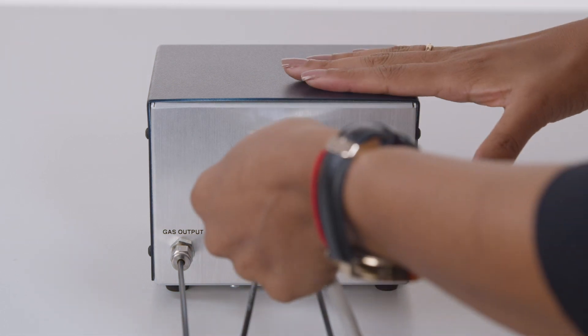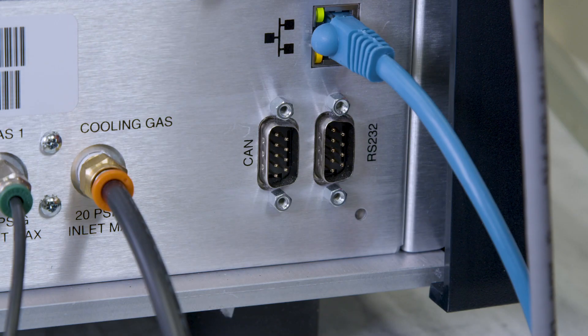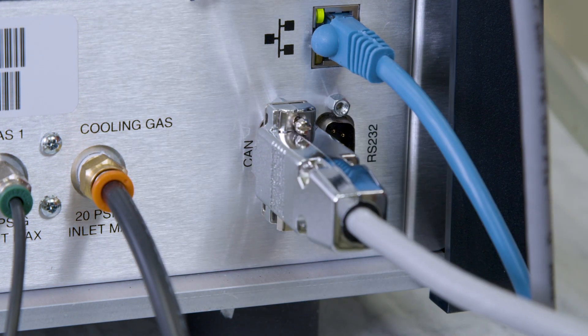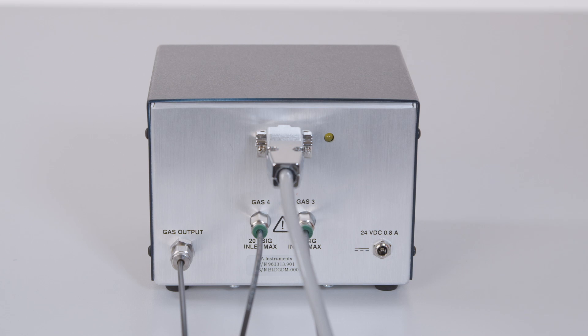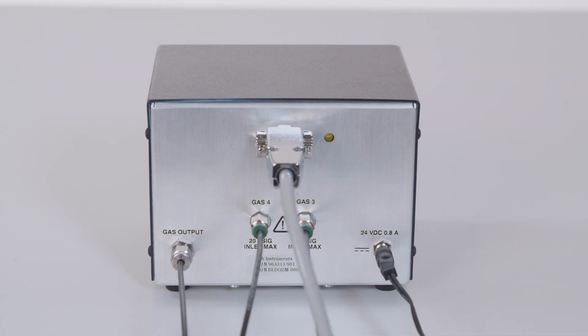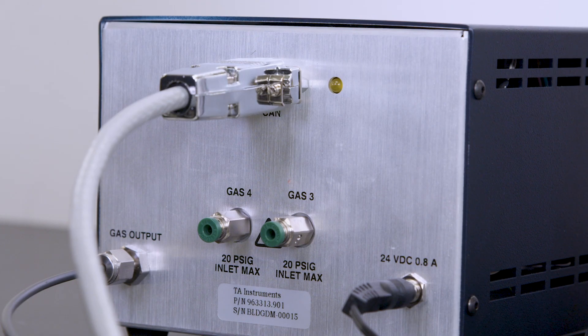Connect the CAN communications cable from the CAN port on the Blending GDM to the CAN port on the rear of the TGA or SDT instrument. Plug the power cord into the power port on the back of the Blending GDM and the main end into a power outlet. Verify that the power LED on the front of the Blending GDM is on and the CAN LED on the back of the unit blinks.